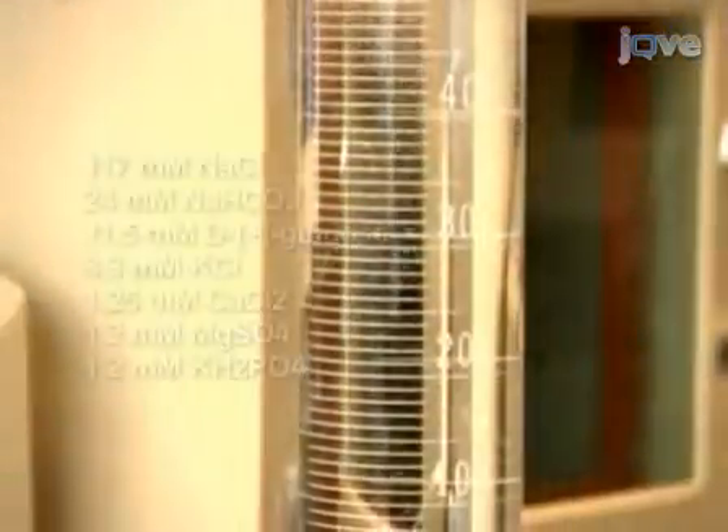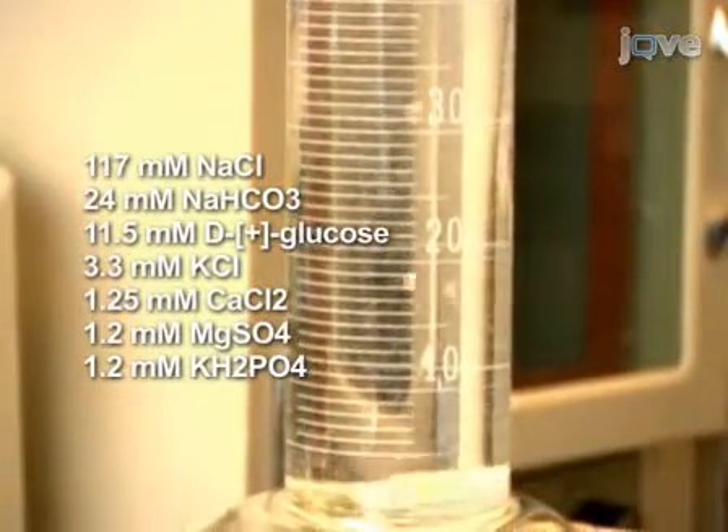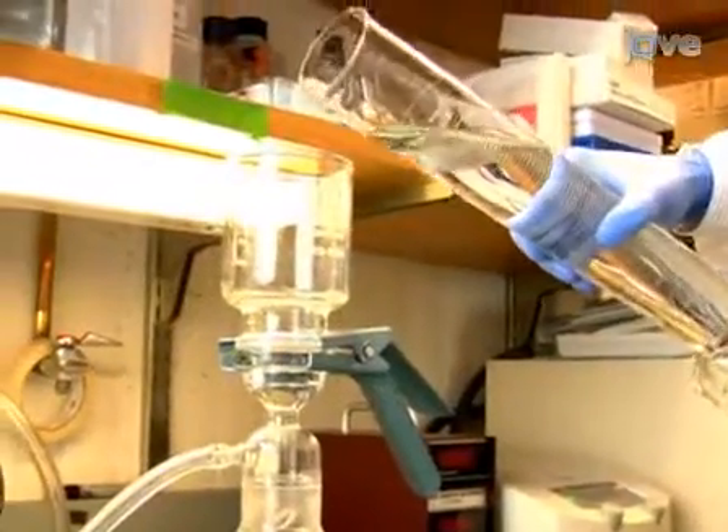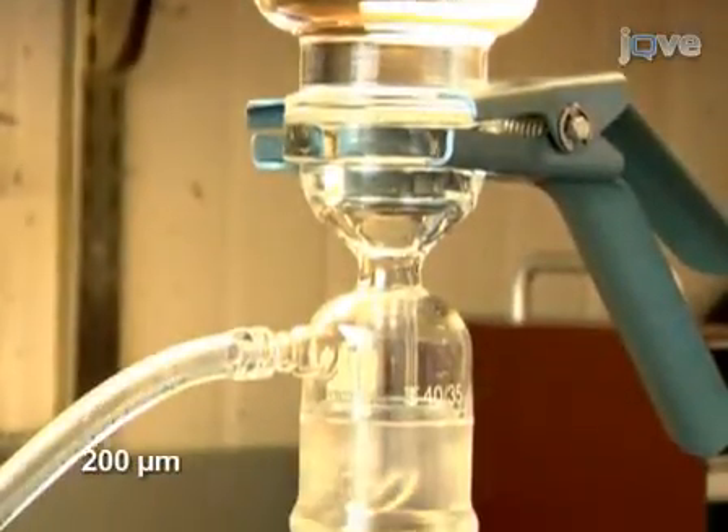On the morning of the experiment, mix up 4 liters of Krebs-Henseleit solution. After mixing up the solution, remove undissolved particles with a 200 micron filter using vacuum filtration.